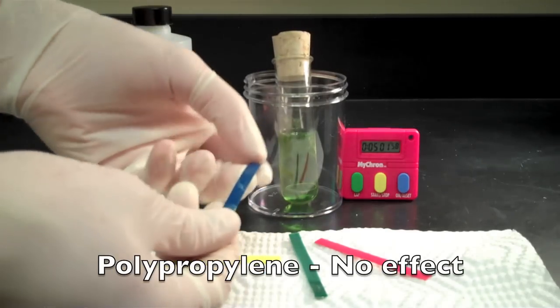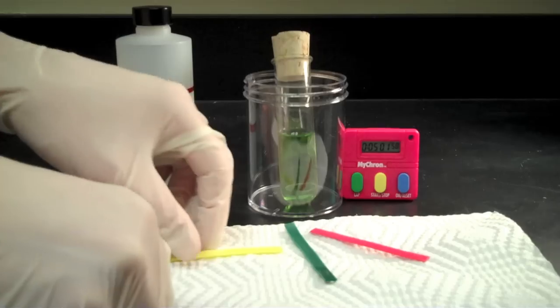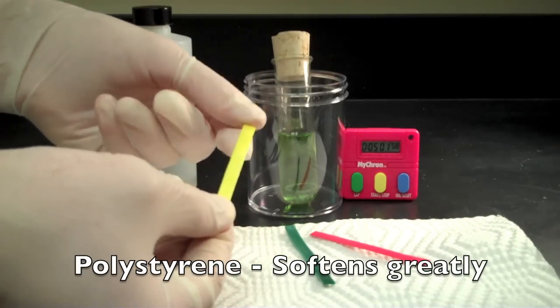The acetone had no effect on the blue strip of polypropylene. The yellow strip of polystyrene softened greatly and is now very sticky.